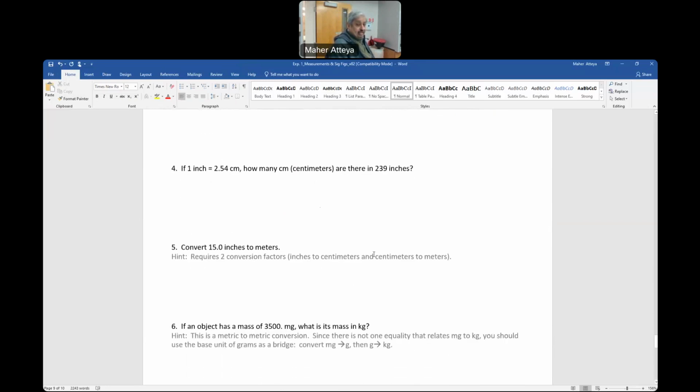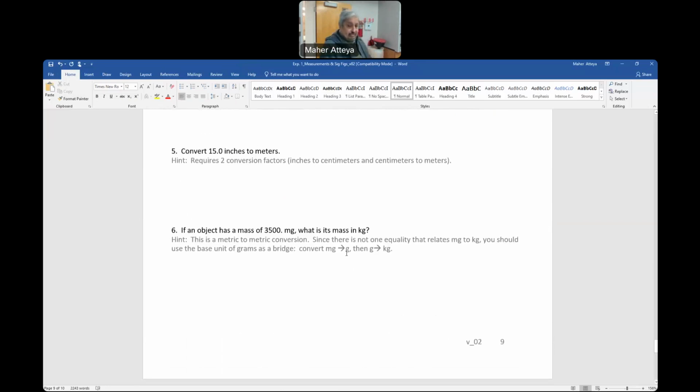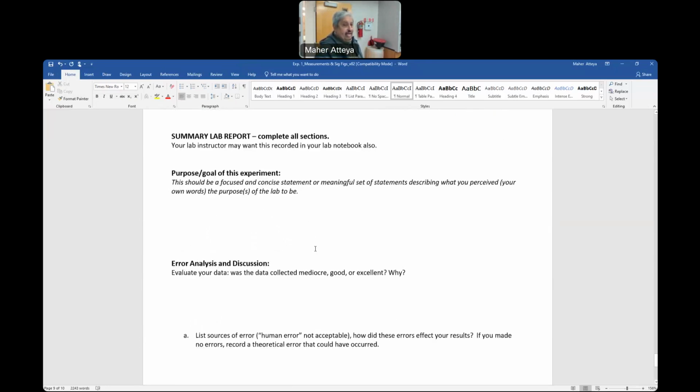Okay, guys? So now you did all this conversion, you can do those. And if you have any question, come and see me, I'm here. And then you do the lab report. You will not follow this lab report here. We'll have our own lab report. So I have for you here, let me minimize this one for the time being, and go to the density here.